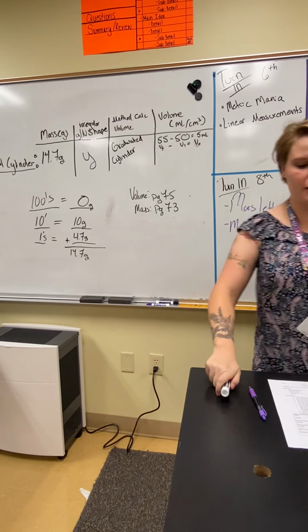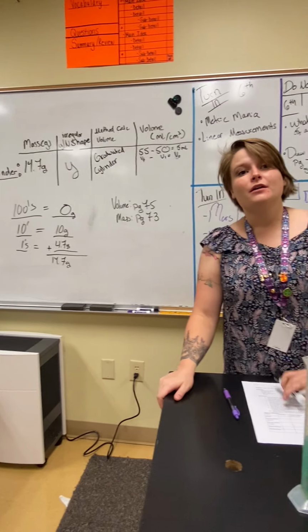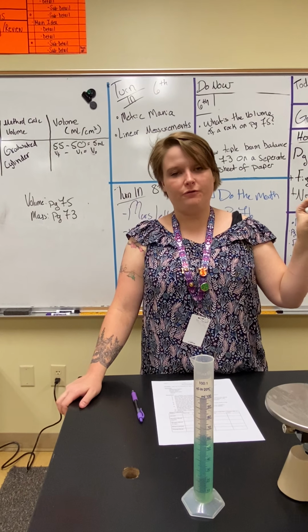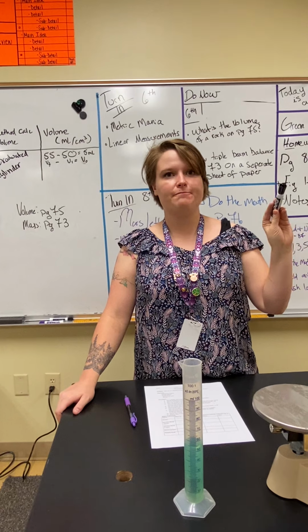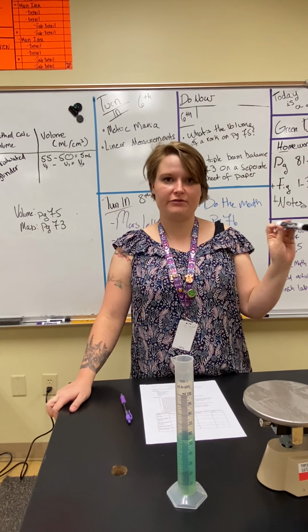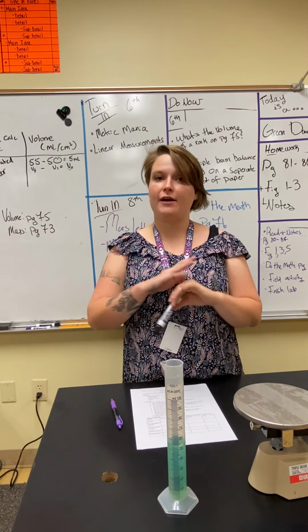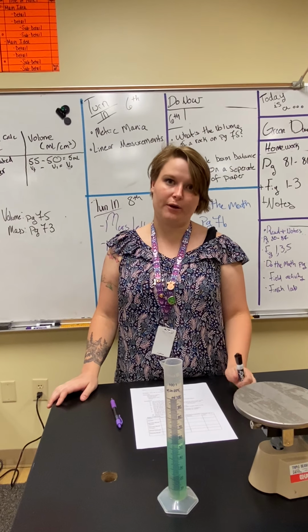So what I'm gonna do now is show you the values that were measured for each, the volume in them, and we're gonna show you the triple beam balance. And by doing that, you are going to have to calculate and fill in the table. I'm not gonna spell it out for you. So I showed you how I did it here. I already have all the values measured. You're just gonna have to figure out how to read it, okay?